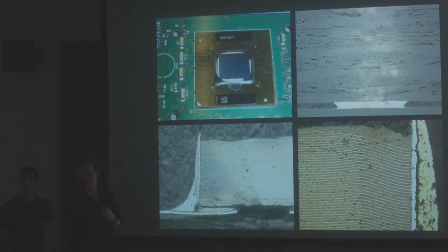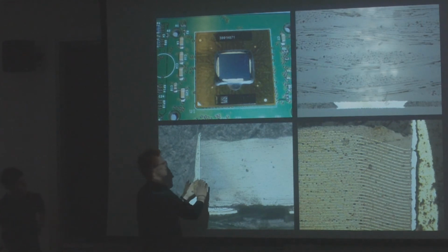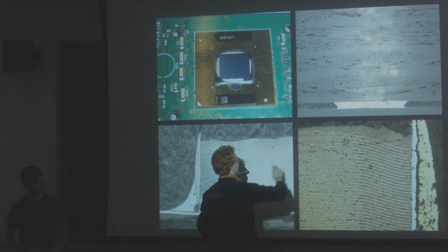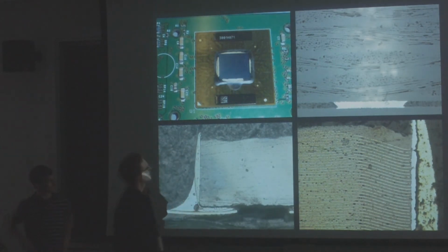So that image is a zoom in of what part in the first image? This is on the right side. It's a cross section of these capacitors here. Okay, so if you sliced it, I believe it's this way. Yeah, if you sliced it along this cross section, that's what you'd get, one of these. Oh, okay. And then this is what happens if you zoom in again. It would be like this corner of it, zoomed in more. Oh, wow.